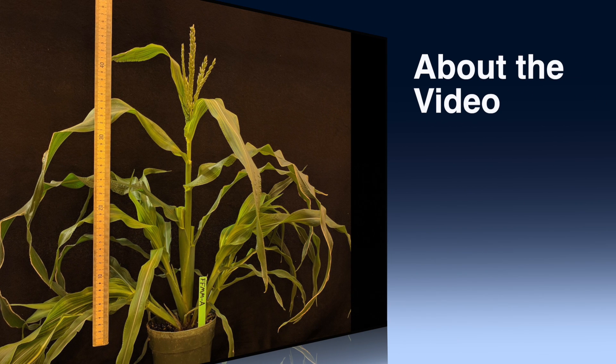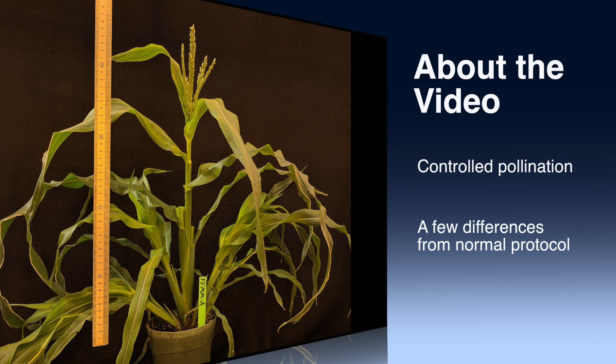Controlled pollination is important for genetic analysis. Covering the ears and tassels of maize plants helps prevent contamination by errant pollen grains. This pollination protocol is largely the same as the normal maize pollination protocol, but highlights some tweaks that are necessary due to the small stature of mini maize.